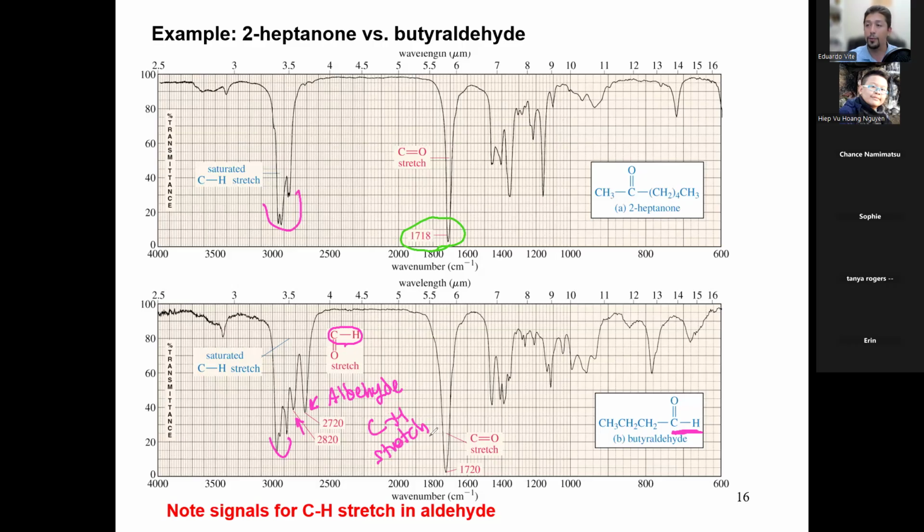That can help you tell the difference when you have a carbonyl peak and you want to know if you have an aldehyde. Sometimes it's one peak, sometimes it blends in and you can't really see it, so you need other information, right? And again, I'm going to change color now. I'm going to use red. You can be like, well, what about this? Well, what about this? And what's this? Who knows, man? Who knows? I'm not going in blind.